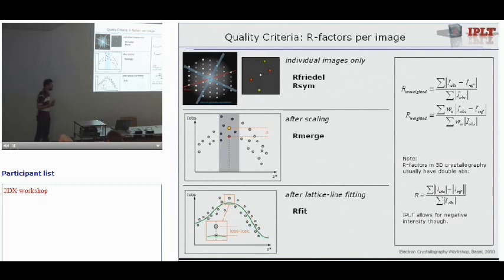So this means also that the lattice line fit itself will never be less than 0. But it might be that there are some data points that are below 0 if the lattice line fit is very close to 0. So we keep these in.